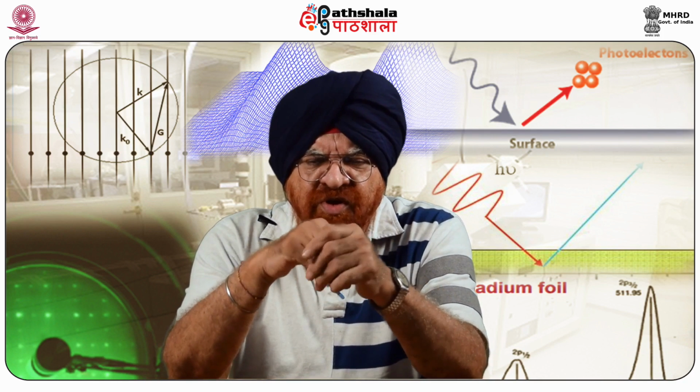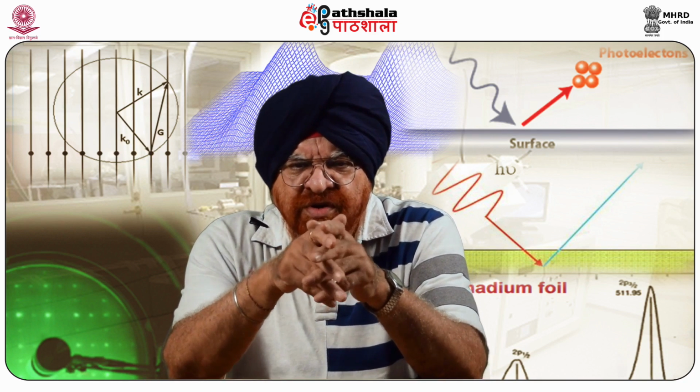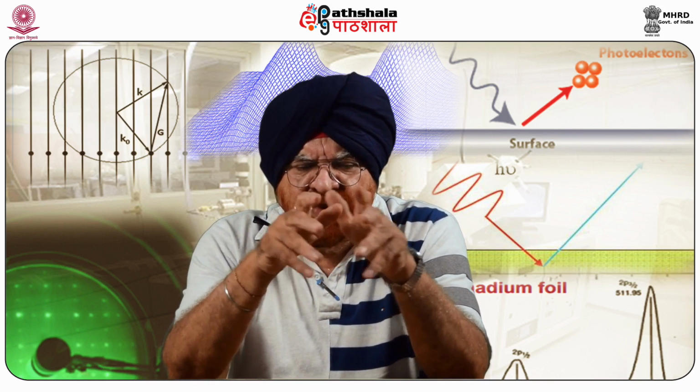Chemical state analysis is very widely used for the element carbon. Chemical state analysis of the surface of carbon containing polymers reveals the presence or absence of the chemical states of carbon shown in the letters in bold form.